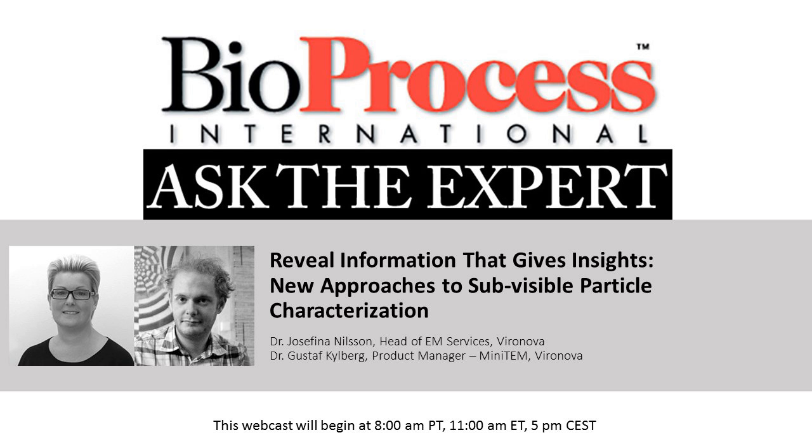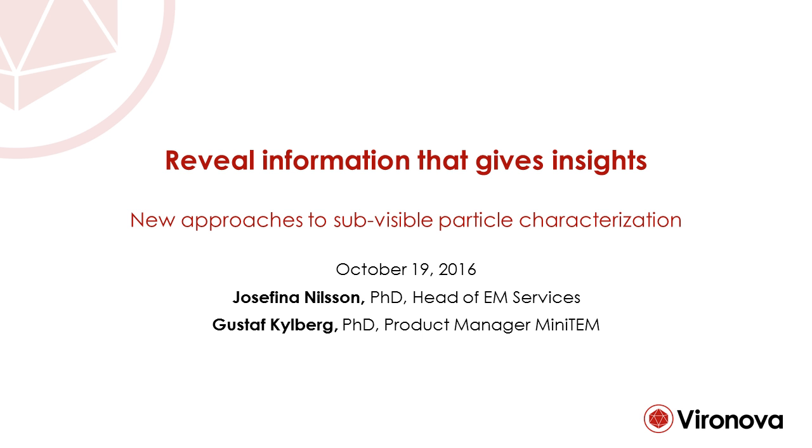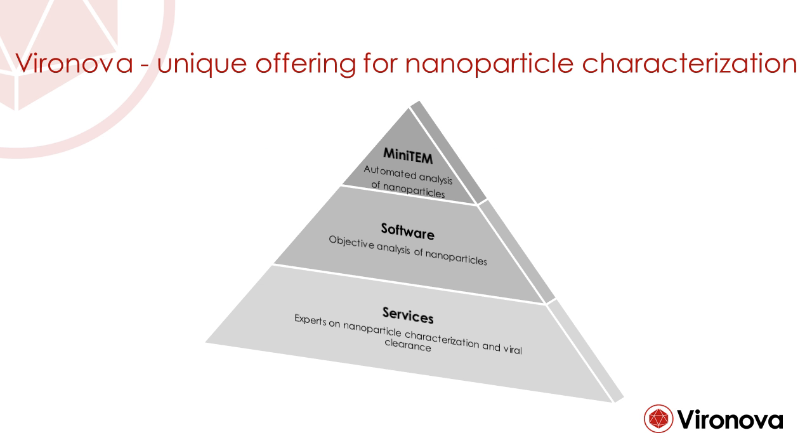So thank you, Leah, for the introduction. Gustav and I today will talk about new approaches to subvisible particle characterization. So first, let me give you a short introduction to how we do this by combining electron microscopy and image analysis here at Vironova. Here, in-house, we have a large group of experts in interdisciplinary fields like electron microscopy, image analysis, programming, and structural biology.